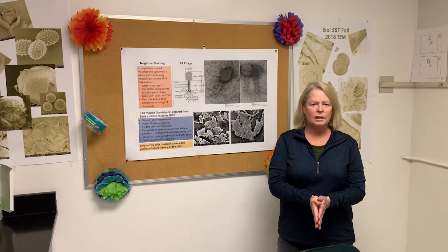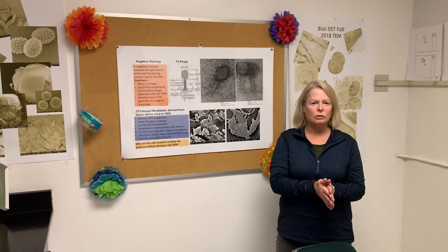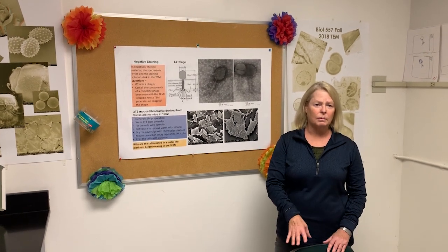Your guide for today is going to be my TA, Spencer. He's an undergraduate who I trained to do both TEM and SEM last year, and I was able to have him be my assistant for SEM this spring.